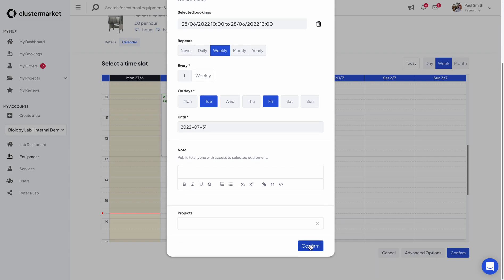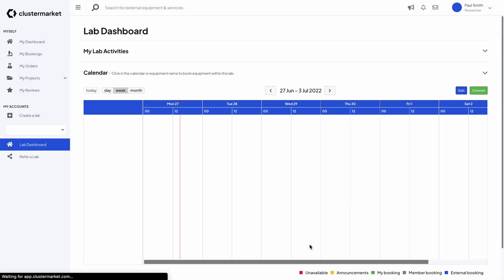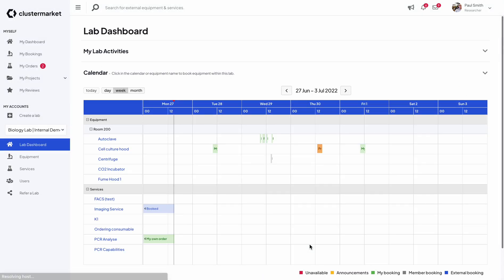After that all you have to do is hit confirm and you basically just created one recurring booking for the next five weeks.